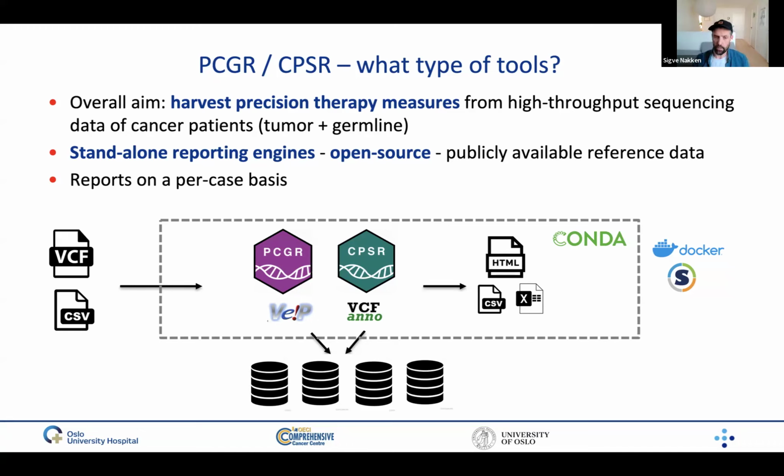We have also made the tools available as containers so that people can run them on systems that require this, both Docker and Singularity. This is something that many users have asked for.